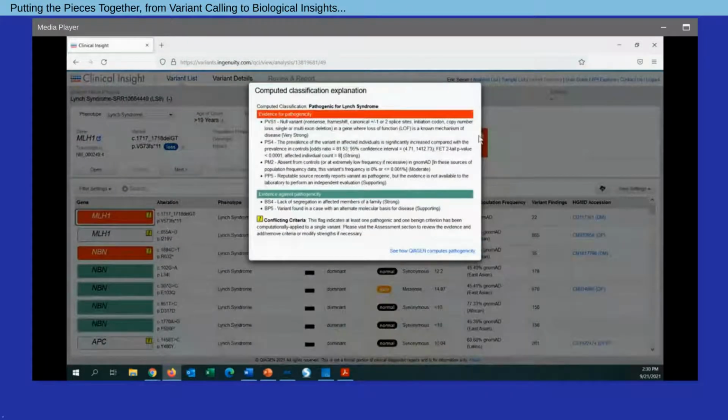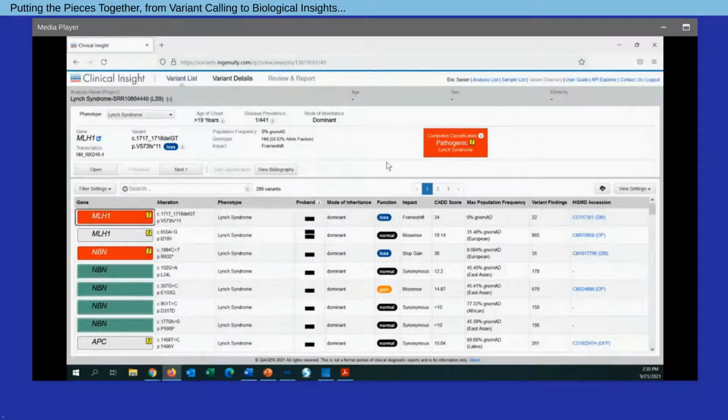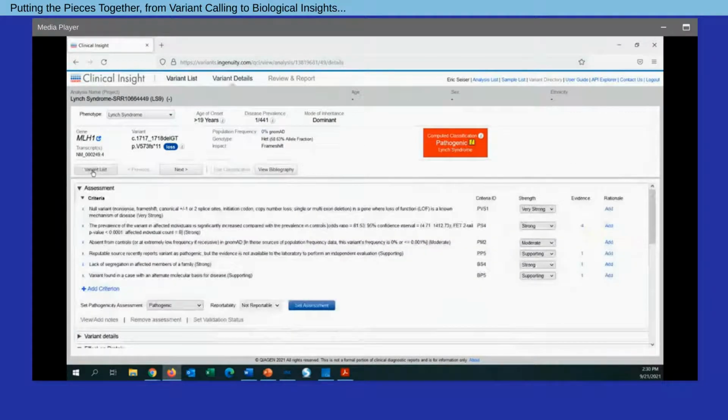So here I can quickly look at the evidence for pathogenicity and also against pathogenicity for a given variant of interest. In this context, though, oftentimes I might want to look at this information in further detail. And to do so, once I have a variant selected, I can click Open.